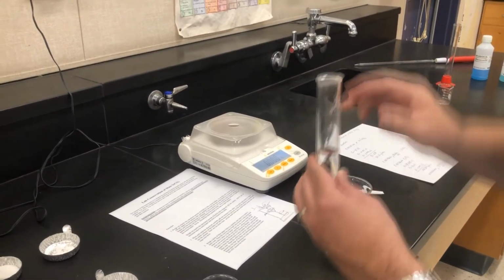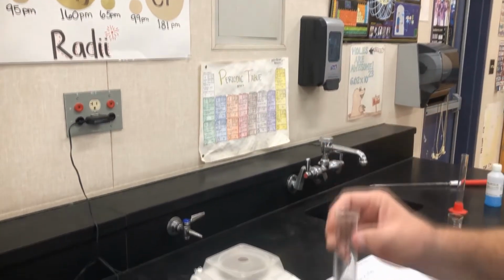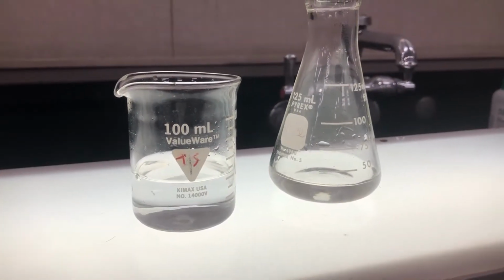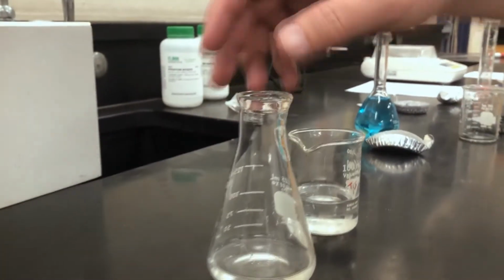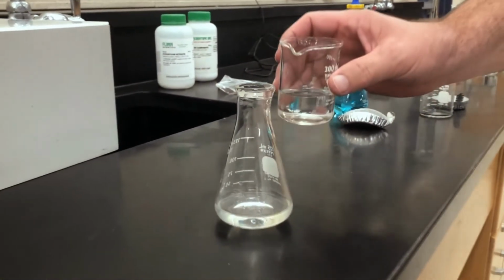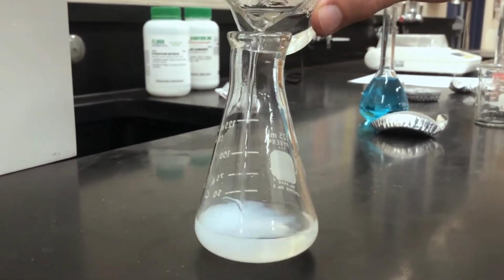Each of the solids is dissolved in a certain amount of water to create a solution that has a molarity of 0.005 moles per liter. The results are nearly colorless, one slightly blue, one slightly yellow, liquids. We will mix these two solutions and you will see the formation of a milky blue precipitate.